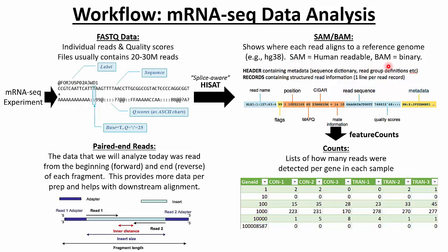And these files are huge. They're going to be gigabytes large, just like the fastq files. So usually people will save their alignments as BAM files to minimize the footprint on the hard drive. And that's especially important for Galaxy because you have a certain quota in Galaxy. You can only save so many files there, and then they limit you. So we're going to save our alignments as BAM, but SAM is another option that you have.